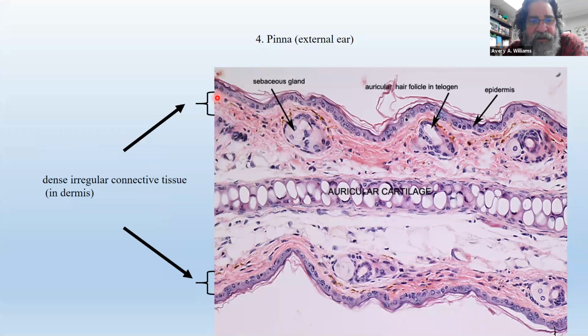And the next thing I'm pointing to is the dermis of the skin that's underneath the epidermis right there. And for the most part, what you see right here, of course, technically there would be a papillary layer, but it's very insignificant.